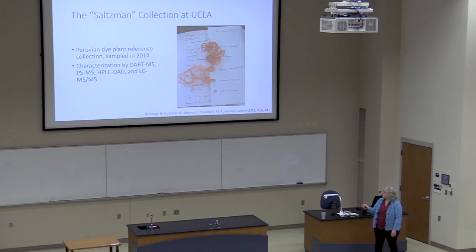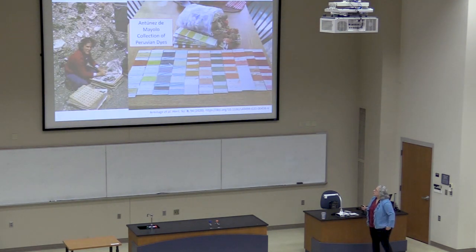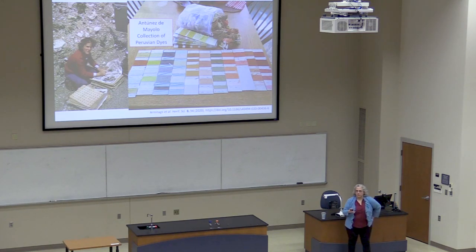So we did our characterizations by DART, another method called paper spray, which I'll talk about here in a second, and Perilla's group did both the LC-DAD and the LC-MS-MS to get a complete characterization. So we published that in 2019, and lots of weird things happened during the pandemic.